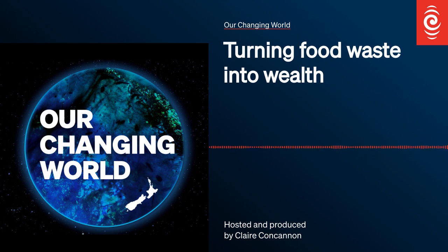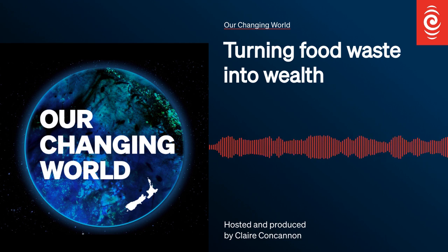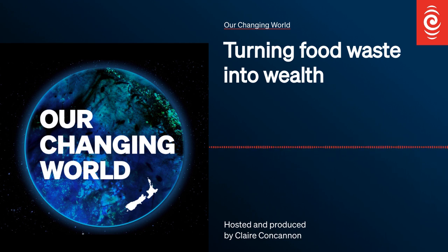There's so much of this brewer's spent grain, barley, malt and wheat, that goes to landfill. The question is, can they make use of it? If they add bacteria to it to ferment it, will it then produce helpful, useful bioactive peptides? Actually, it did show some really good results, like antioxidant, antimicrobial, and anti-obesity effects, which are really great. So I need to remove the water by freeze-drying first, and then grind it into powder and mix it with bacteria to ferment it.